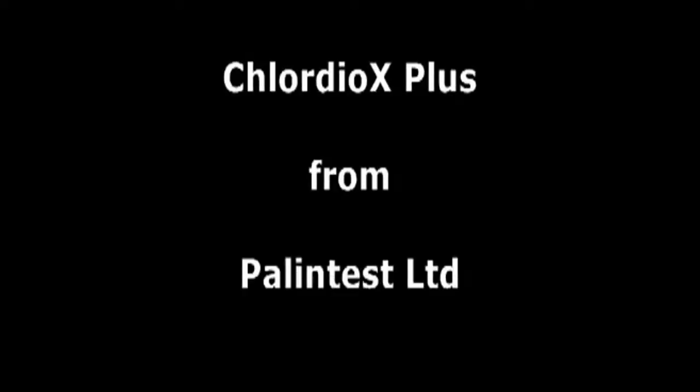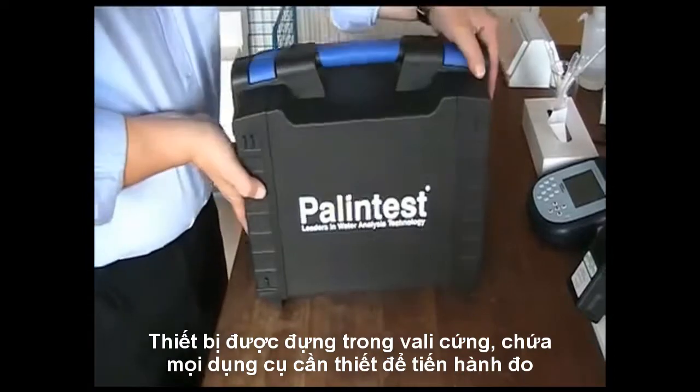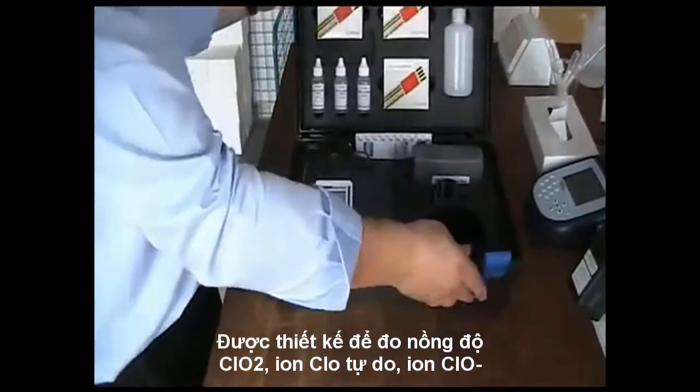Welcome to the Chlordiox Plus from PalinTest Ltd. Supplied in a hard case, the Chlordiox Plus kit contains all of the accessories and consumables required for field testing for chlorine dioxide, free chlorine and chlorite.